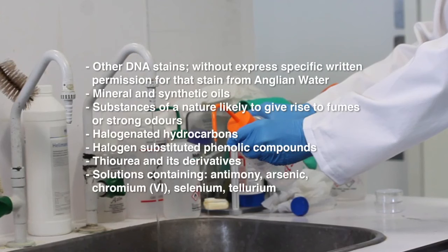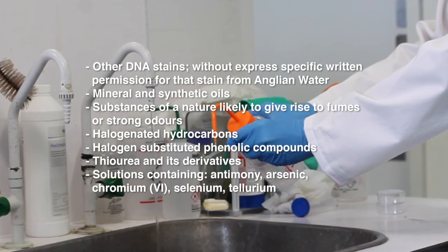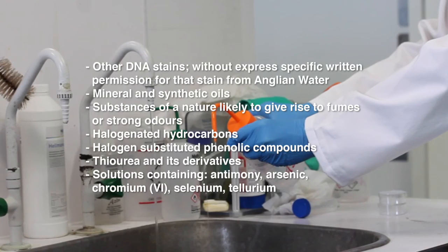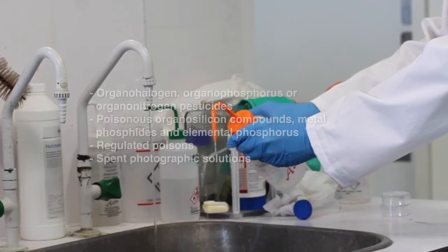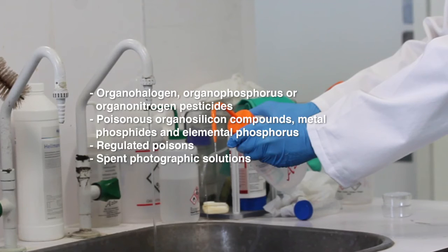stains without express specific written permission for that stain from Anglian Water, mineral and synthetic oils, substances of a nature likely to give rise to fumes or strong odors, halogenated hydrocarbons, halogen-substituted phenolic compounds, thiourea and its derivatives, solutions containing antimony, arsenic, chromium, selenium, and tellurium, organohalogen, organophosphorus or organonitrogen pesticides, triazine herbicides, and any other biocides, poisonous organosilicon compounds, metal phosphides, and elemental phosphorus, and last, regulated poisons. So now you know about all the different waste stations that we have in our lab.